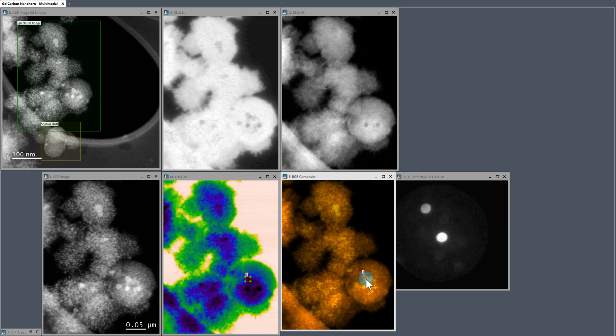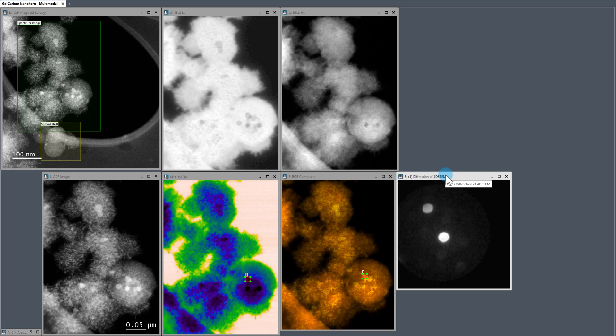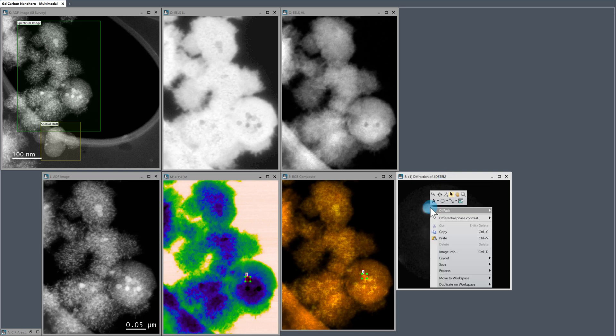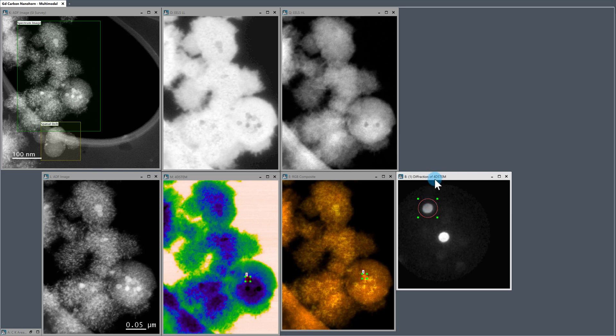And I'd actually like to do some mapping. We can do exactly the same with the diffraction data. So what we do if we want to map from a diffraction pattern is we can use what we call virtual apertures. So we just place an ROI on some feature in the diffraction pattern that we want to map. So I'm going to target this diffraction disk because it's very strong intensity here.